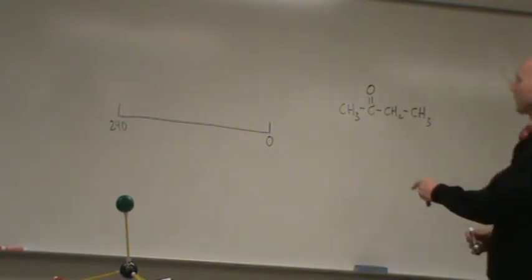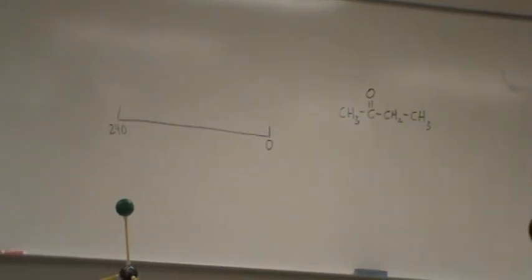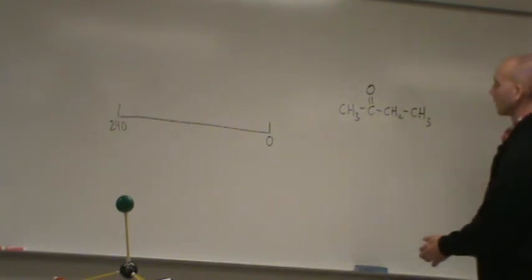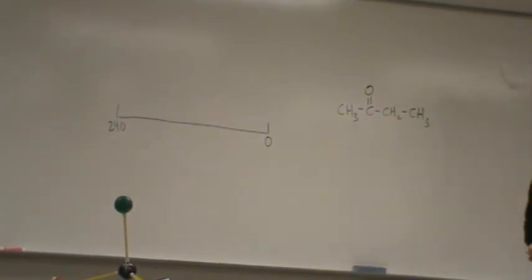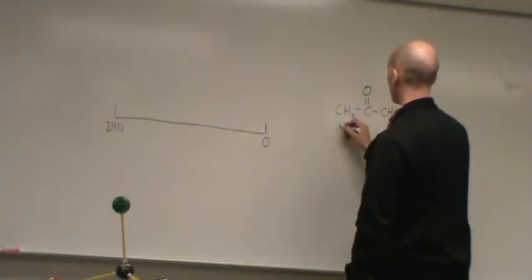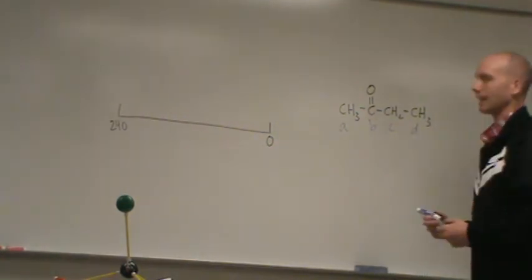If you look at this, we're just looking at the carbon atoms. There's no plane of symmetry, is there? So how many different signals for carbon should I see? Four. 1, 2, 3, and 4. See, that one doesn't have any hydrogen, so I don't care. I'm looking at the carbons. So we call them A, B, C, and D.